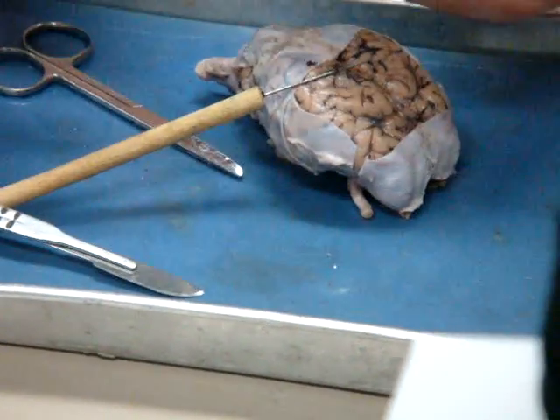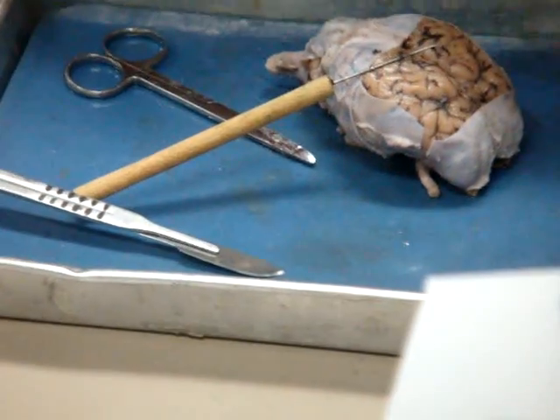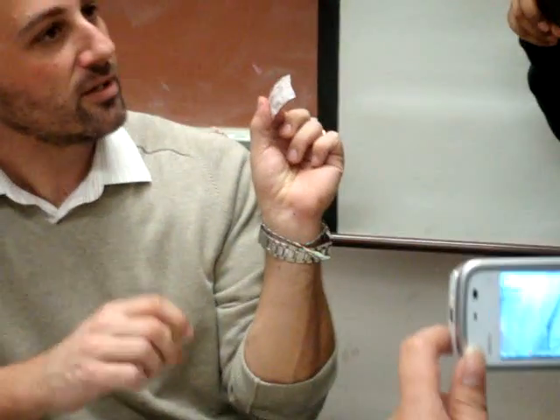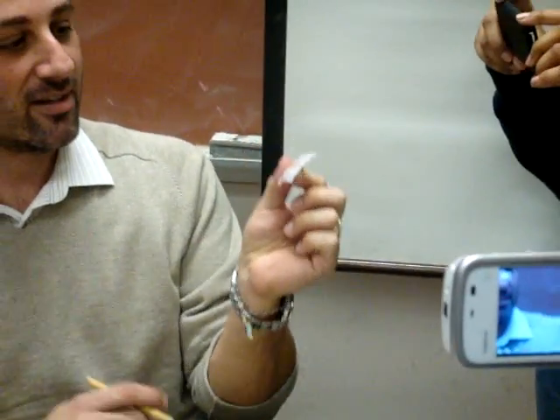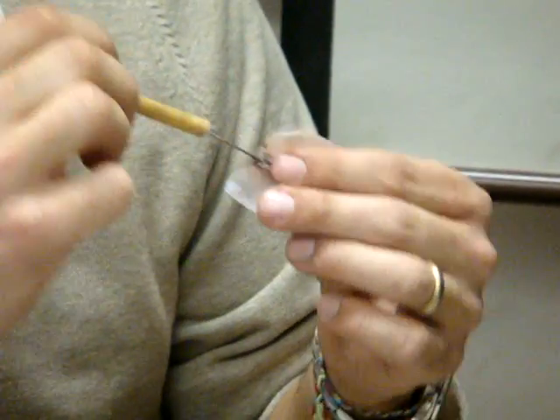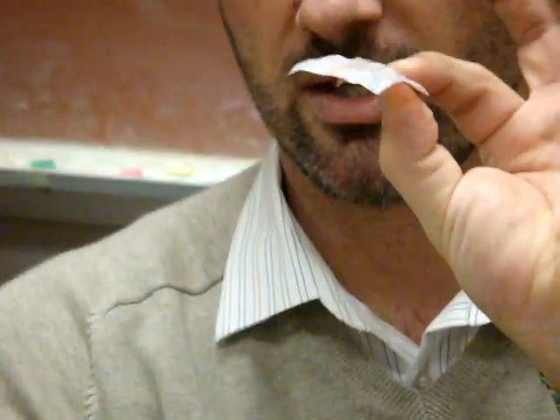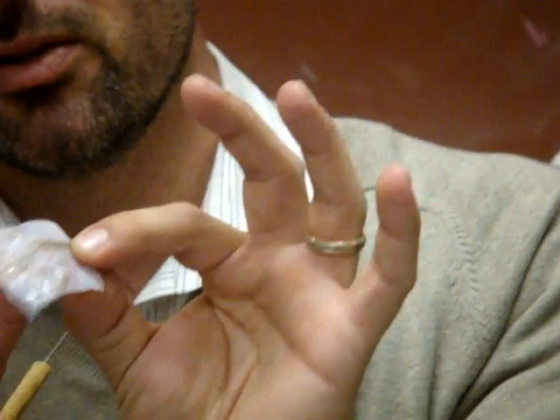The arachnoid mater we're really not going to see. It's sort of this very fine filamentous layer, and it kind of disintegrates. Now, if I remove this from right here, and then I look along this thickened area, I can see that triangular space there? Good point. Okay, and you can see I could actually stick the probe right in there and go all the way through. Okay, and that is the superior sagittal sinus. That space, the little triangular looking space right there. Everybody see that? Okay, so that's the dural venous sinus, and this one is the superior sagittal sinus.